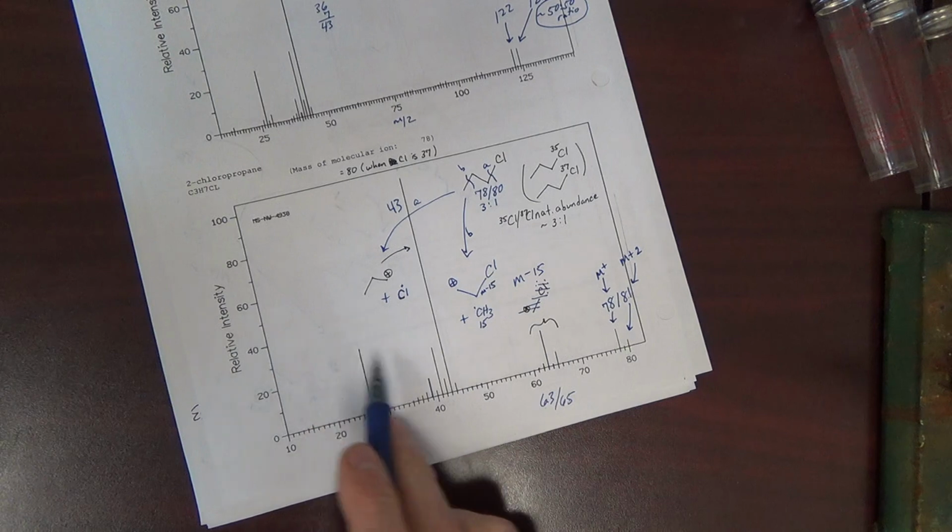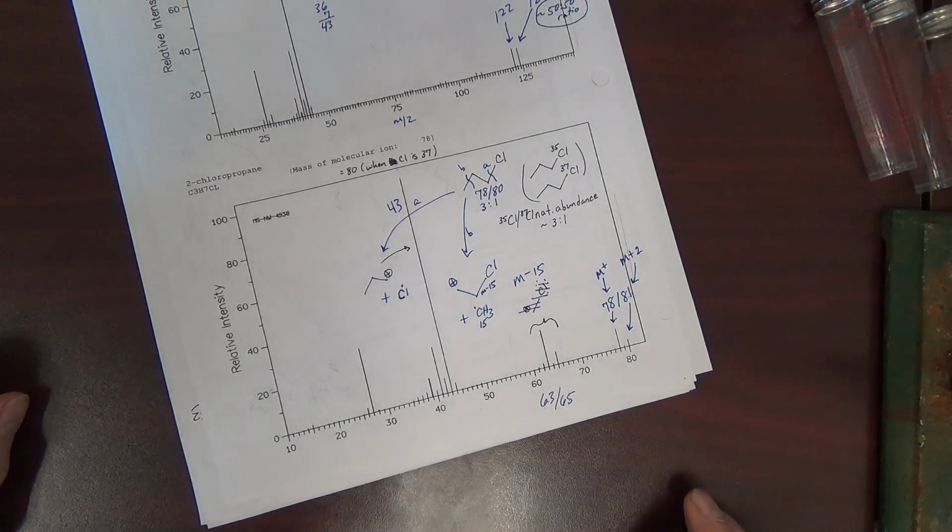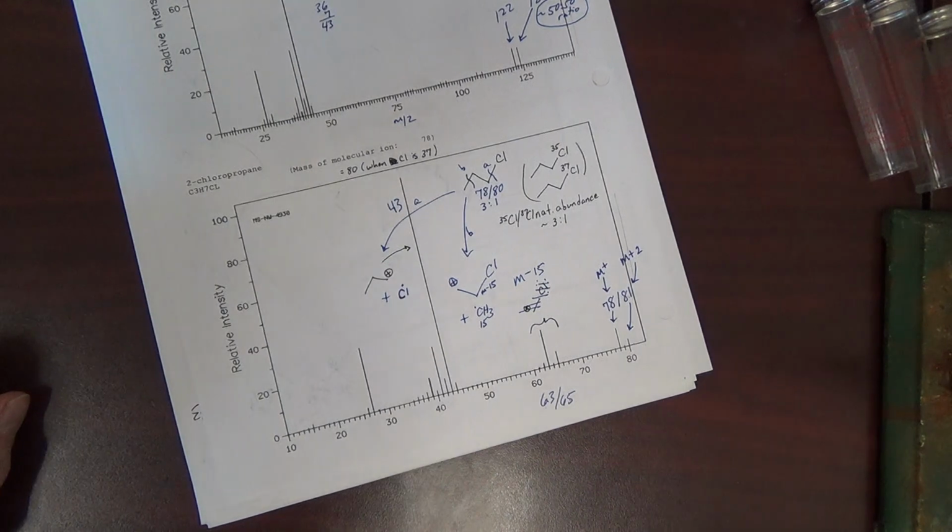We could maybe try to look at the rest. For now, though, that should be enough. We'll keep going. Eventually, we'll come back and sort of pull things together. But right now, we're looking at different mass specs and looking at different types of cleavage peaks that are occurring. On this page, importantly, we saw the idea of isotopes.